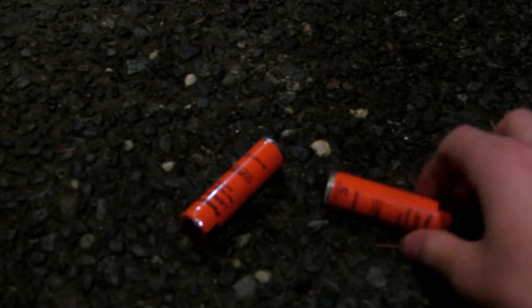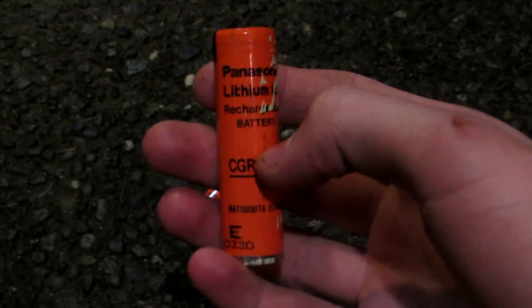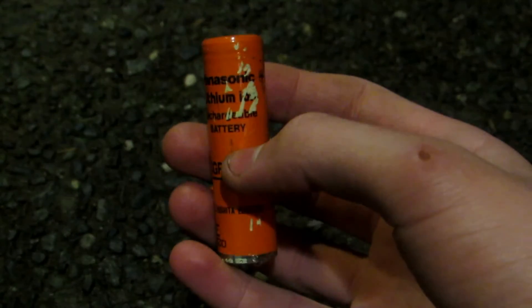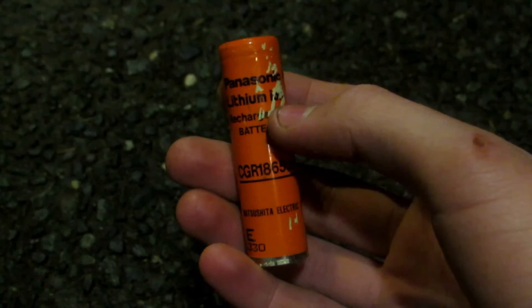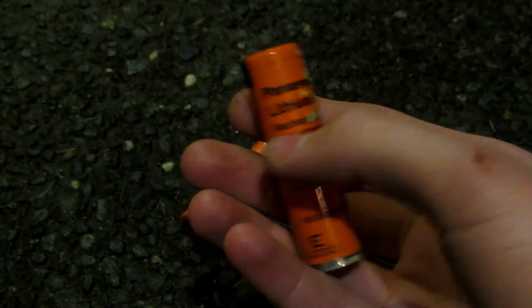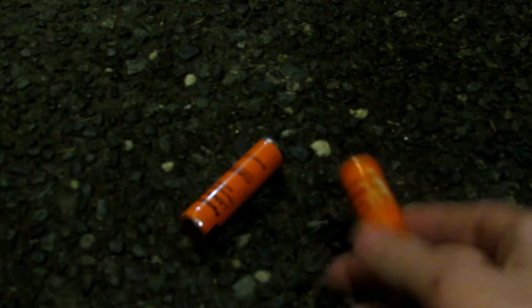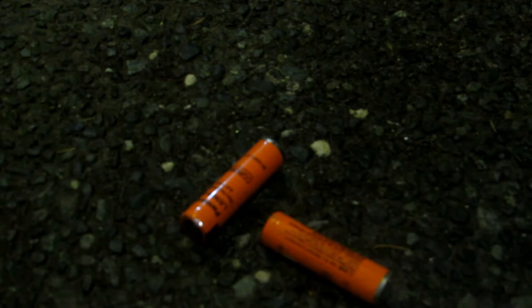To make cobalt chloride, we first need a source of cobalt. These dead lithium ion batteries actually contain cobalt — one of the electrodes contains lithium cobalt oxide. I just got these from the dump. Dead ones work best because they're the cheapest, so you can just go to your local dump's battery recycling spot and pick some up.